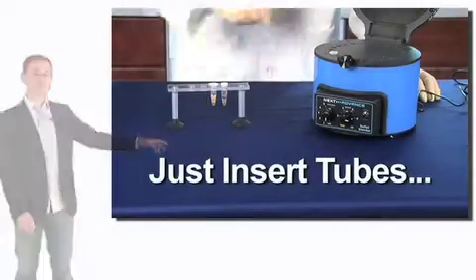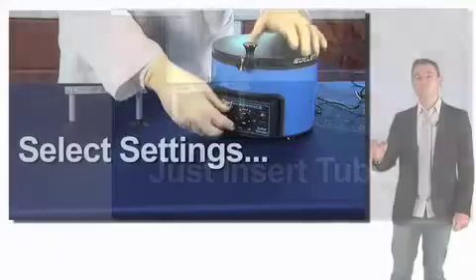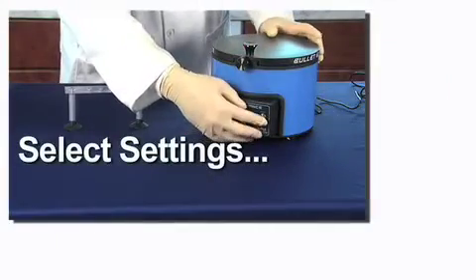Just add the beads, put the tubes in the holes, select the time and the speed, and press start.